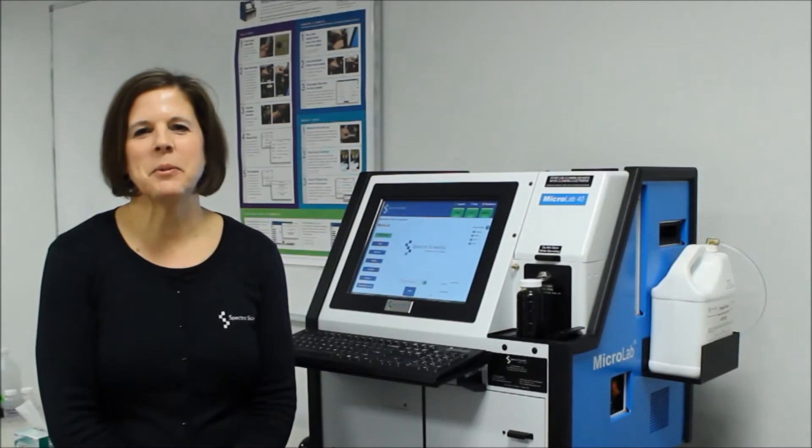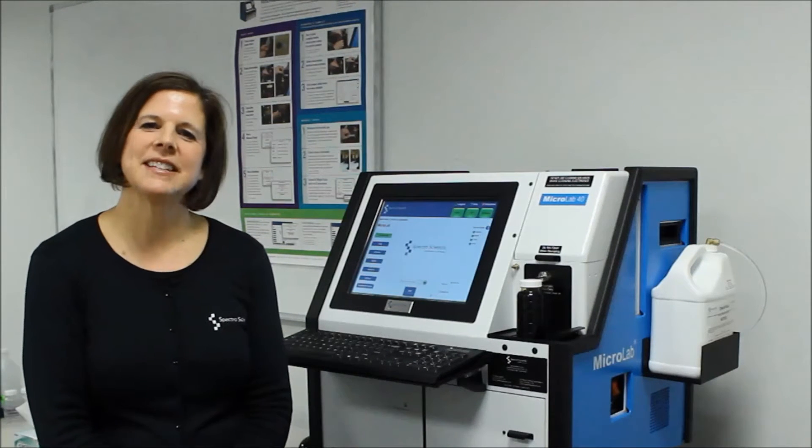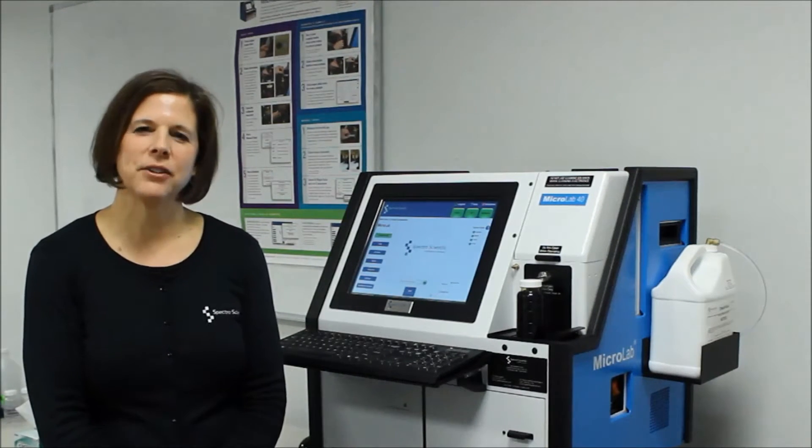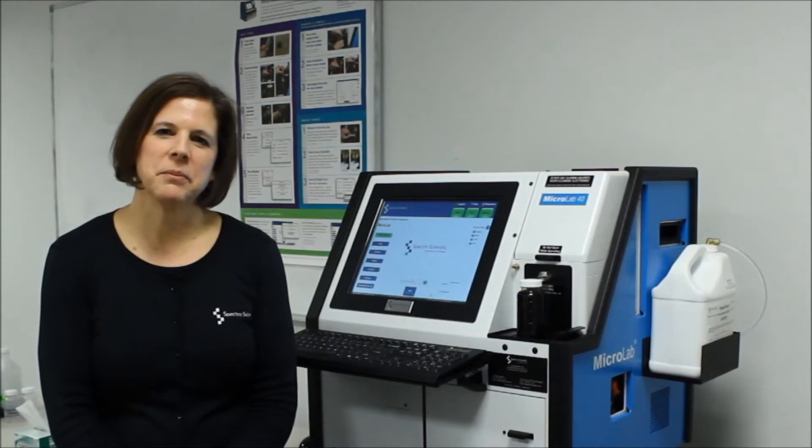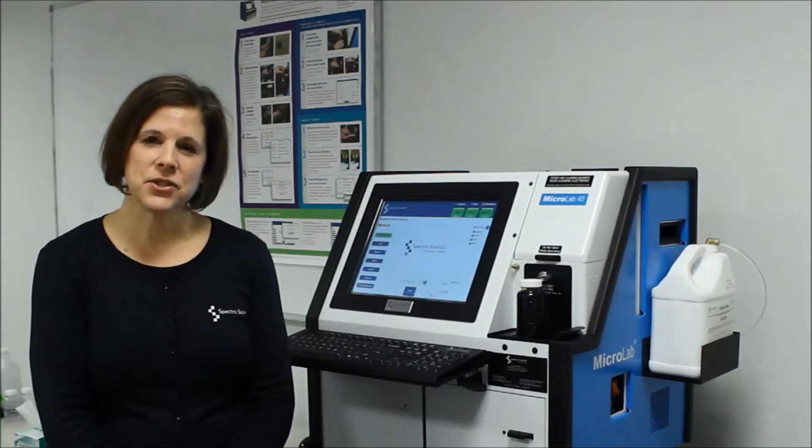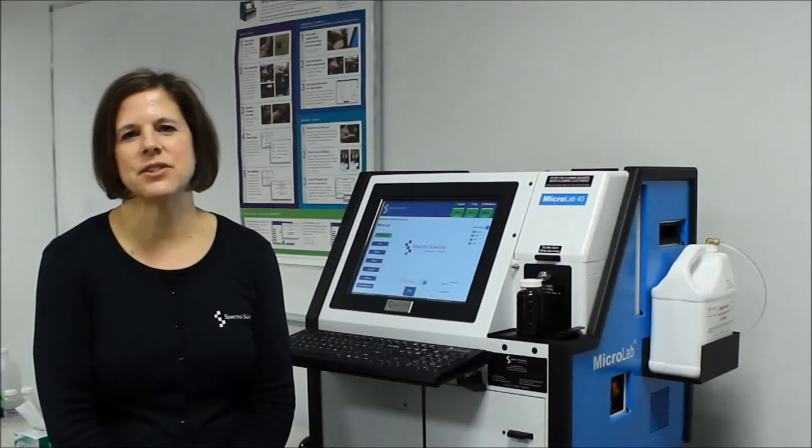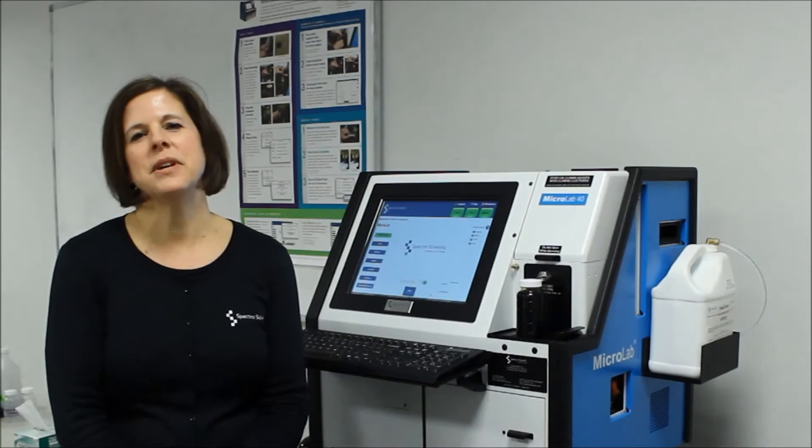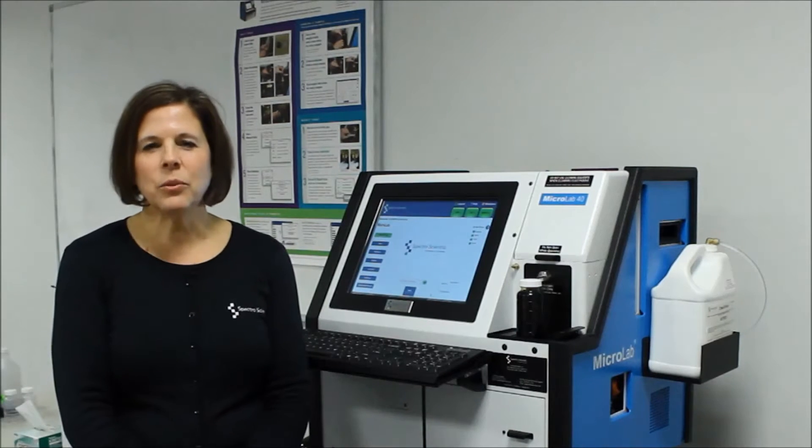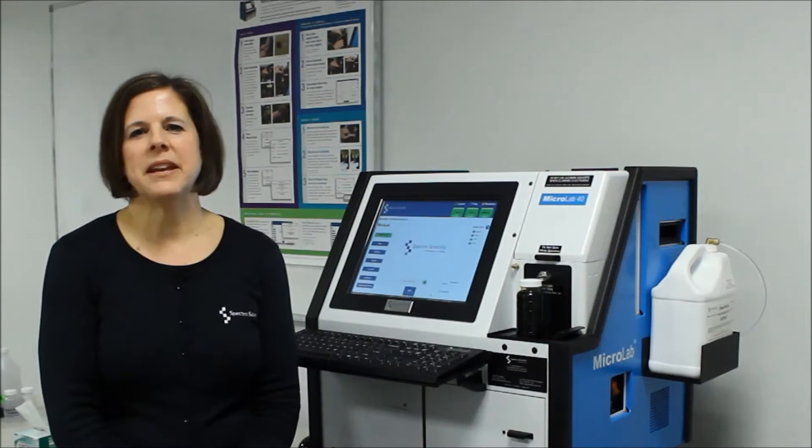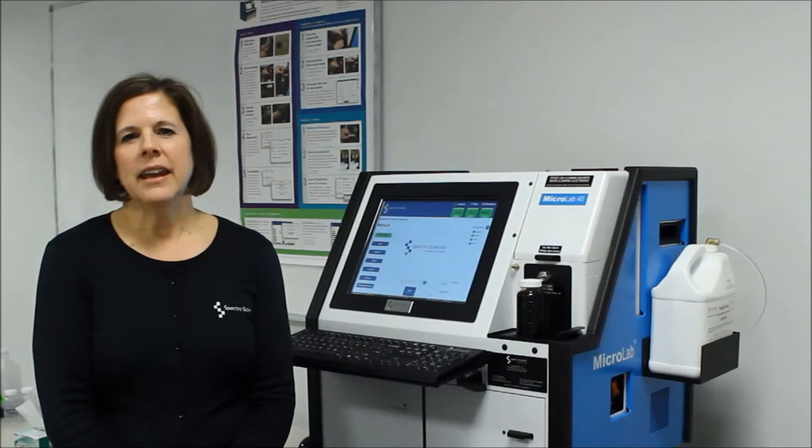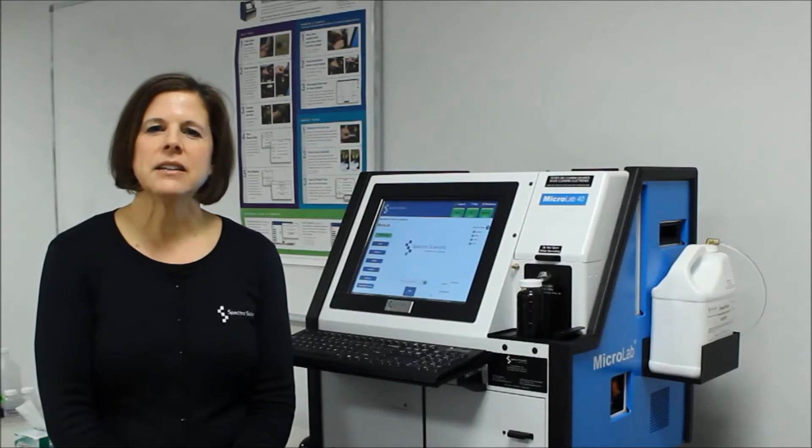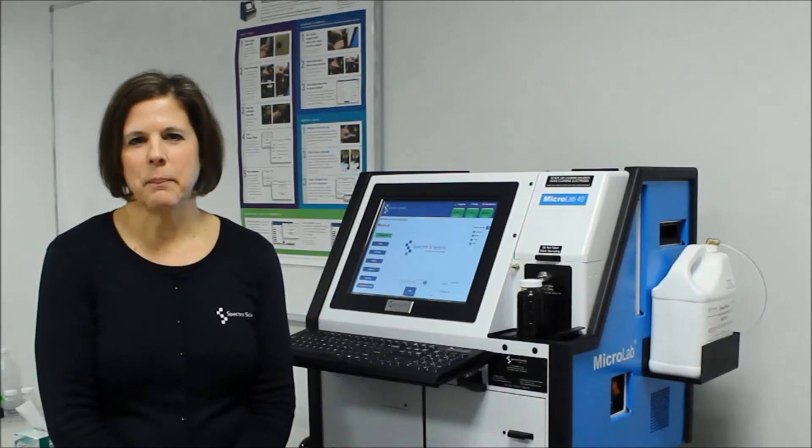Hi, I'm Janet Keefe. I'm Global Product Manager for Spectro Scientific's Microlab product line. Today I'm going to be doing a demonstration of the operation of this instrument to show you just how easy this all-in-one automated instrument is to run and get a complete oil analysis in less than 10 minutes.